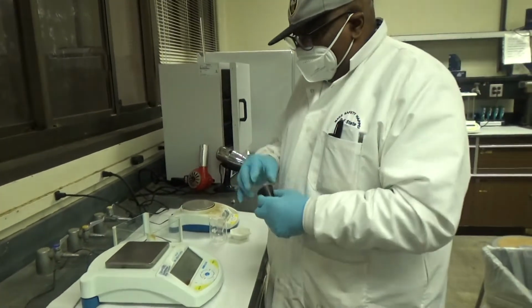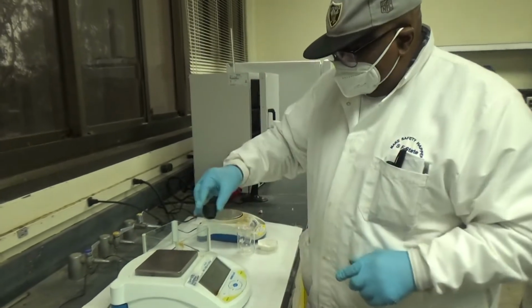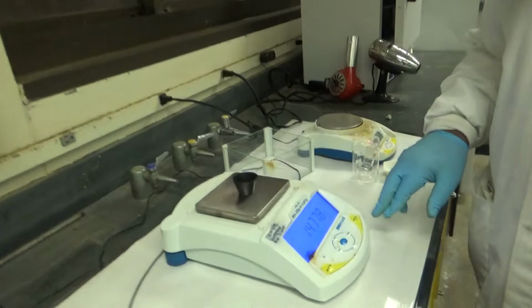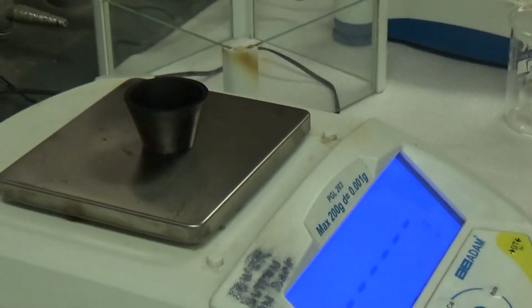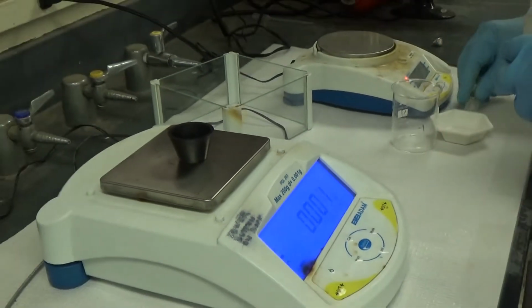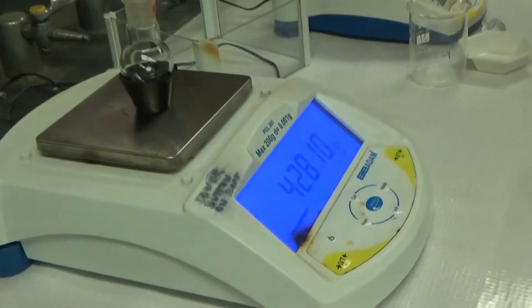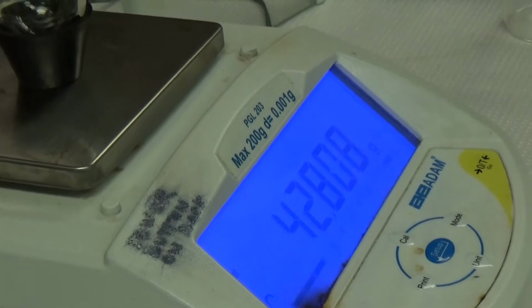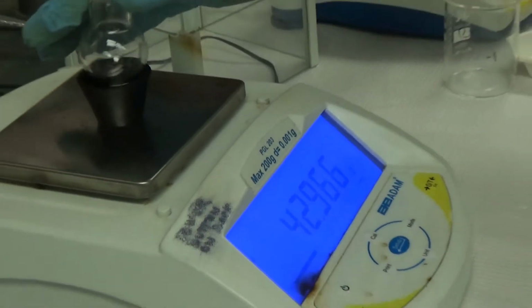For taking weight, I use the neoprene adapter. You weigh your round bottom flask with the product. You use the neoprene adapter and zero it, bring that to 0. So now it's zeroed. And you put your flask on top. Now you have the final weight: 42.808.